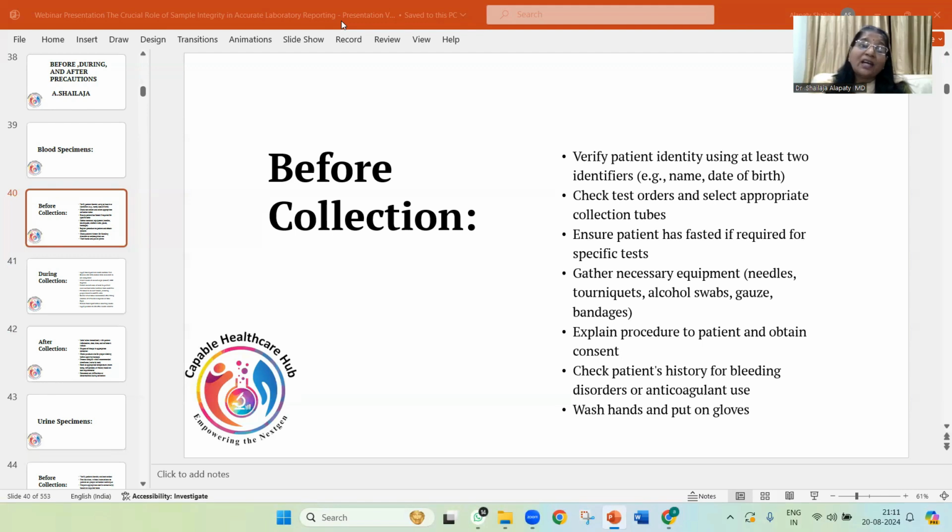What has to be authorized also, it's okay. Printed report, it doesn't matter. But authorized and released, so that the doctors can see. Okay. And what about the collection time?